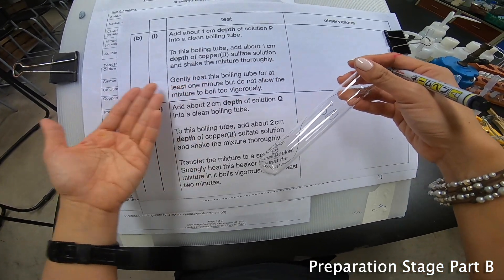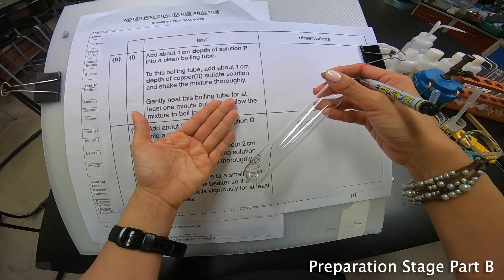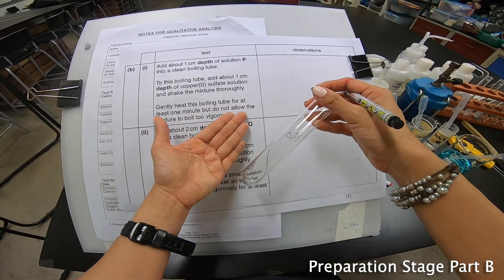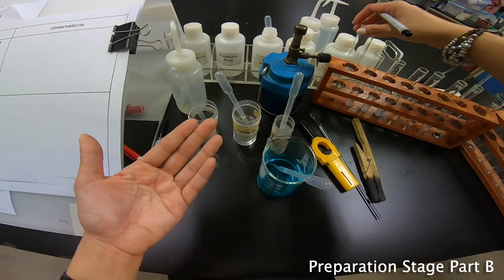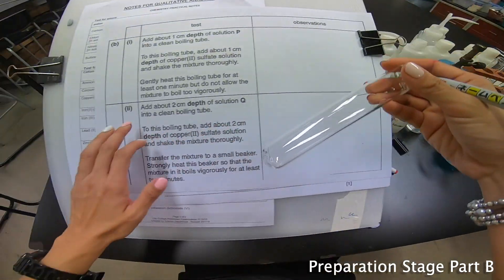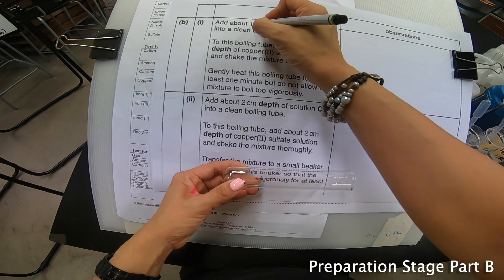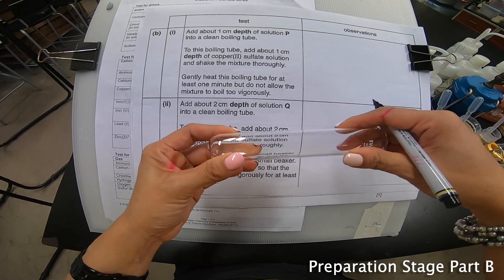And then you have to gently heat this test tube for at least about 1 minute and do not allow the mixture to boil too vigorously. So I'm going to put this back here. Now next part, to add about 2 cm depth. Now from 1 cm depth I become 2 cm depth. So make sure I put 2 cm.